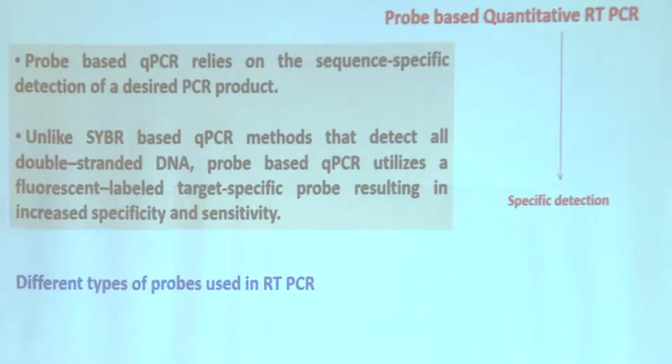We are only telling in a different name. Correct? One point. So, the principle here is we are going to use fluorescent labeled target specific probes. I am not calling it as target specific primers. The choice of word is very important here.